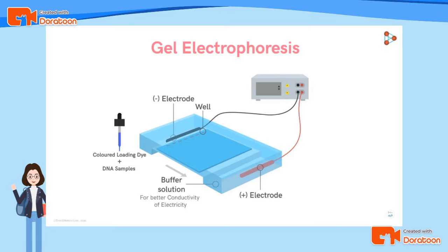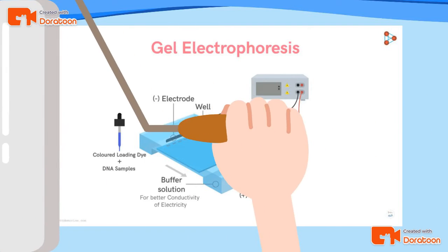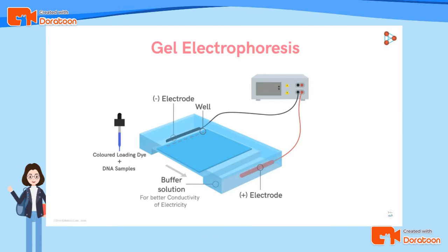Since DNA is colorless and we can't track its movement in the gel, we need color loading dye to track the movement of the DNA. After we load the DNA mixture into the well, we turn on the power supply, and then we get the result.